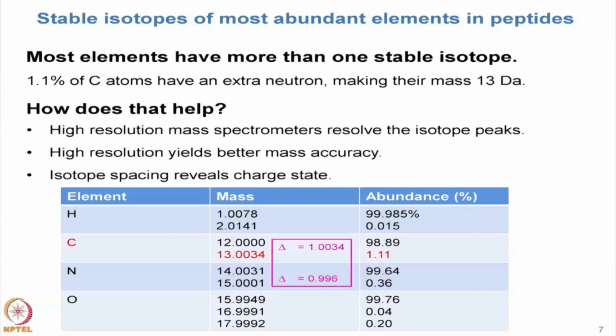I've been doing this for about 25 years, and it was only a few years ago that I was looking at something like this and I said, wait a minute, a neutron has a different mass depending upon whether it's attached to nitrogen or to a carbon? And the answer is yes, of course, because we do not measure the actual mass of something. We measure the mass based on energy.